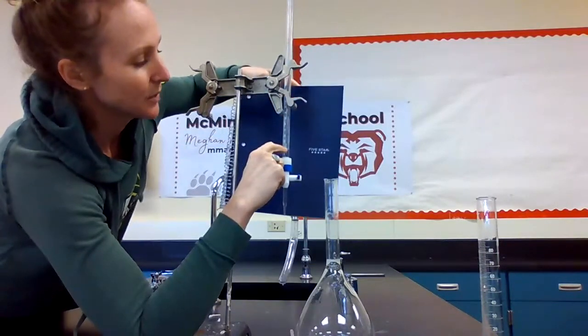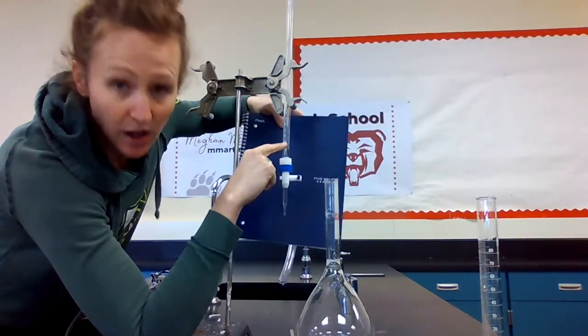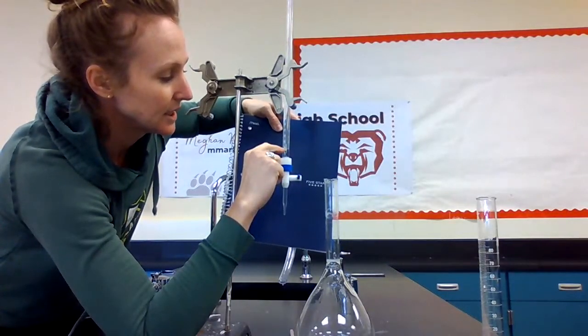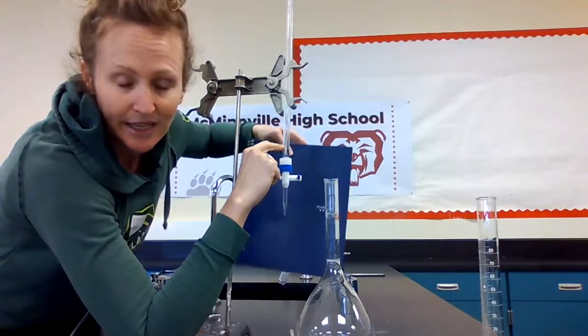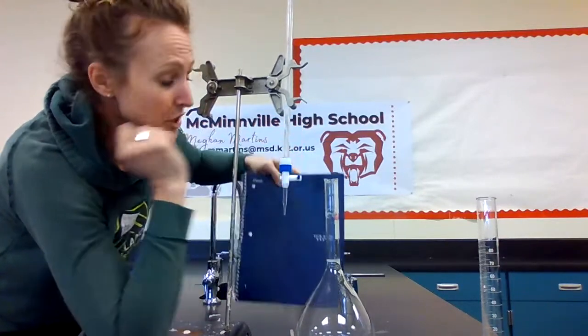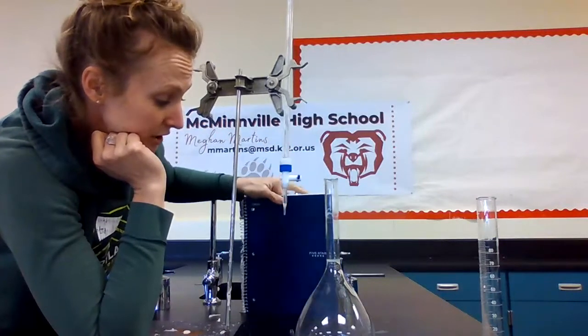However, this burette is marked smaller than the graduated cylinder. It's marked every tenths place, which means you can estimate the hundredths place. So a burette is really good for measuring small volumes. If you want to add a small volume, a burette is a really good thing to use.